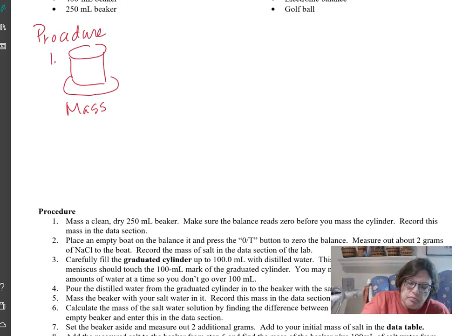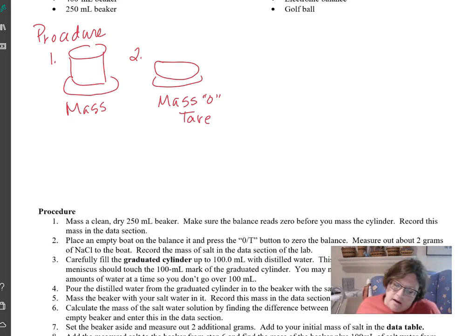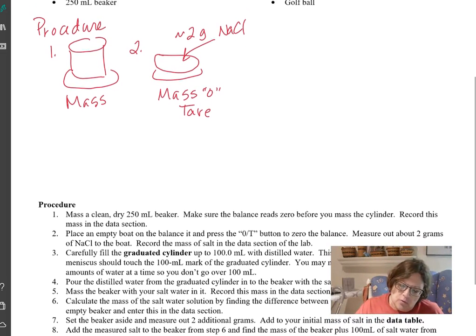Step 2 says to place an empty boat on the balance and zero it out. Okay, so we have boats. Zero it out or tare it, and add about 2 grams of sodium chloride. Okay, does it have to be 2? No, as long as you write down how much you have. So if you have 2.11, great. If you have 1.97, great. Somewhere in that area, all right? So mass out about 2 grams and record.